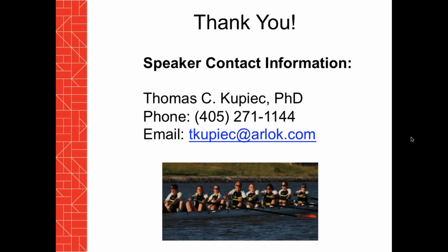Okay, how would you count a large colony on a surface plate? Regardless of the size of the colony, it's still going to be counted as a single colony. If it starts with multiple, you won't be able to tell by the time you're reading it, so you can't try and interpret or guess anything. That's more about the growth rate of the bacteria than having multiple colonies. So you're still going to count it as one, no matter the size.